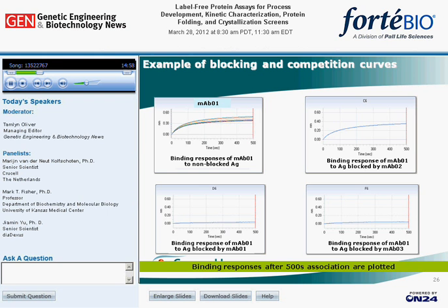This is in contrast to the two lower panels, in which clear competition is shown for antibody 01 with itself and with antibody 03. For the analysis of competition, usually final binding responses are plotted. An example plot is shown in the next slide.